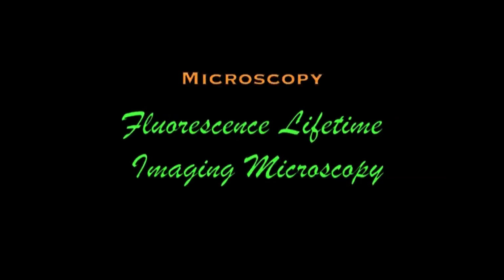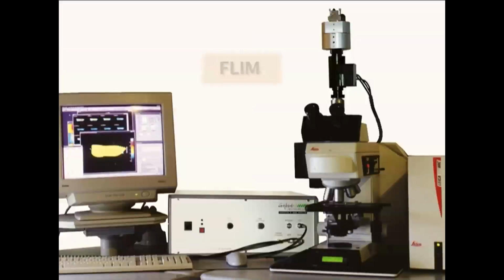Another assay that is used in fluorescence microscopy is fluorescence lifetime imaging microscopy, which is FLIM. Fluorescence lifetime is defined as the time the excited electron spends in its excited state. Now, that is the lifetime of a fluorophore. Now, this is the backbone of FLIM. Another important aspect of this FLIM study is that we are trying to study this lifetime of the fluorophore, during which the intensity of fluorescence is not of major concern.